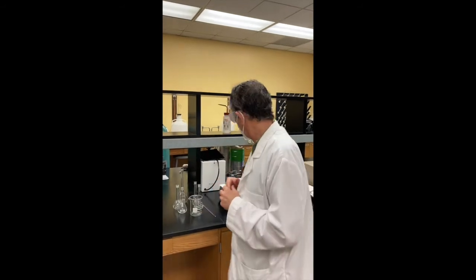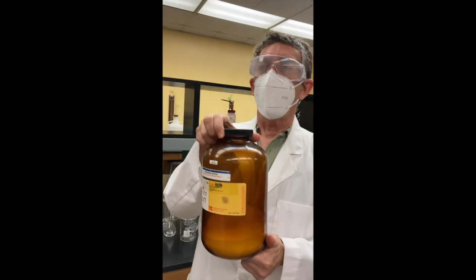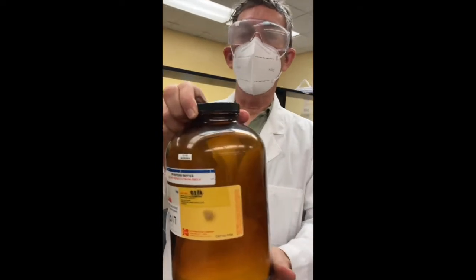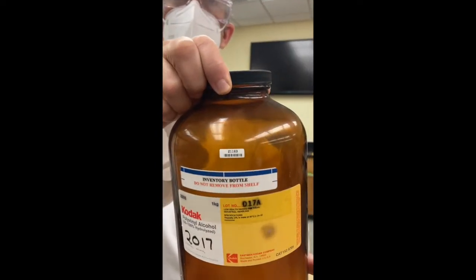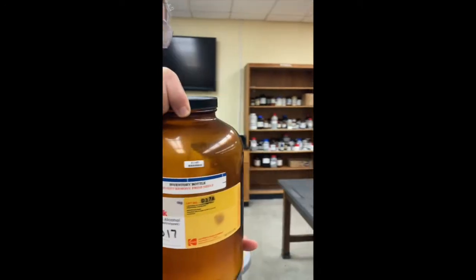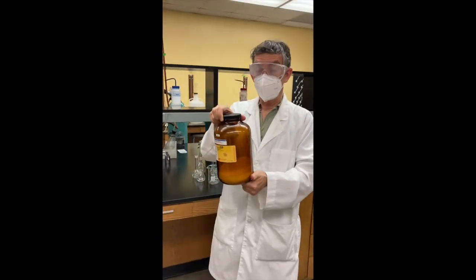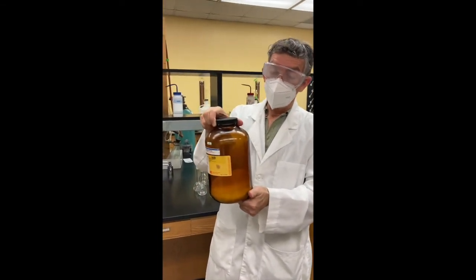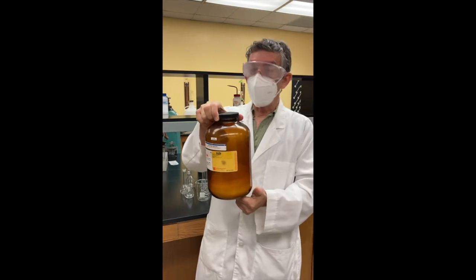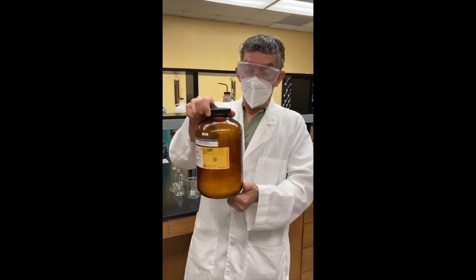So we're going to do this. We've got one particular polymer. It's polyvinyl alcohol. We have a sample here, but we do not know the average molecular weight of this sample. And so we're going to carry out an experiment that will tell us the average molecular weight. That will be our first goal. The properties of the polyvinyl alcohol will be sensitive to the average molecular weight.